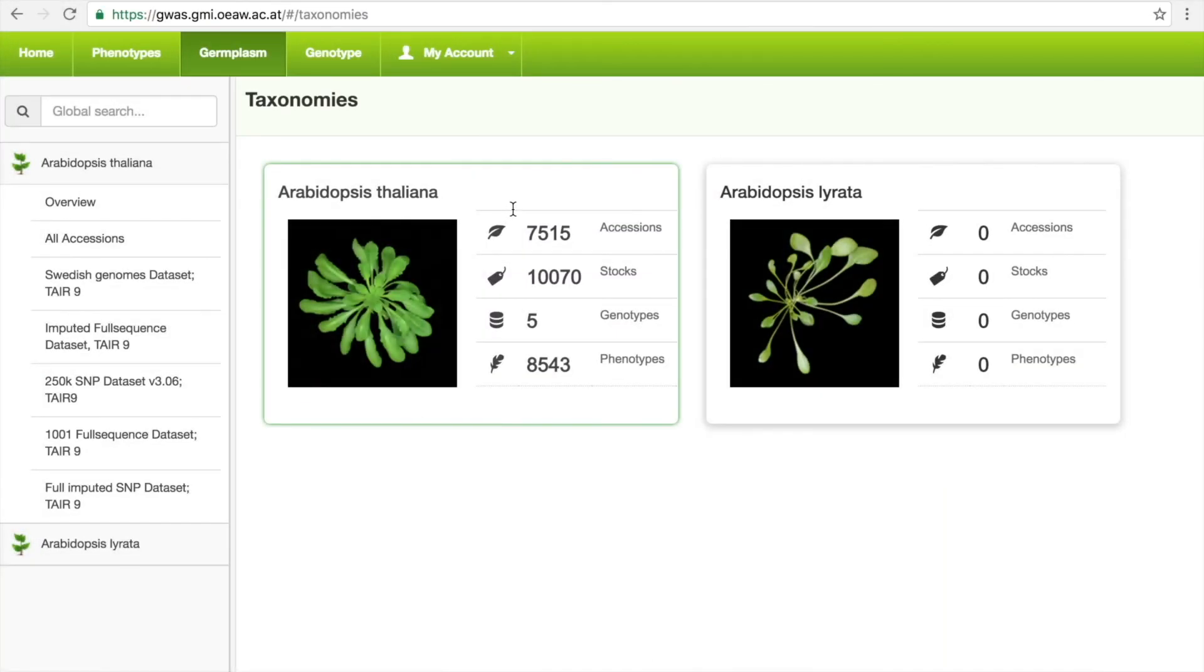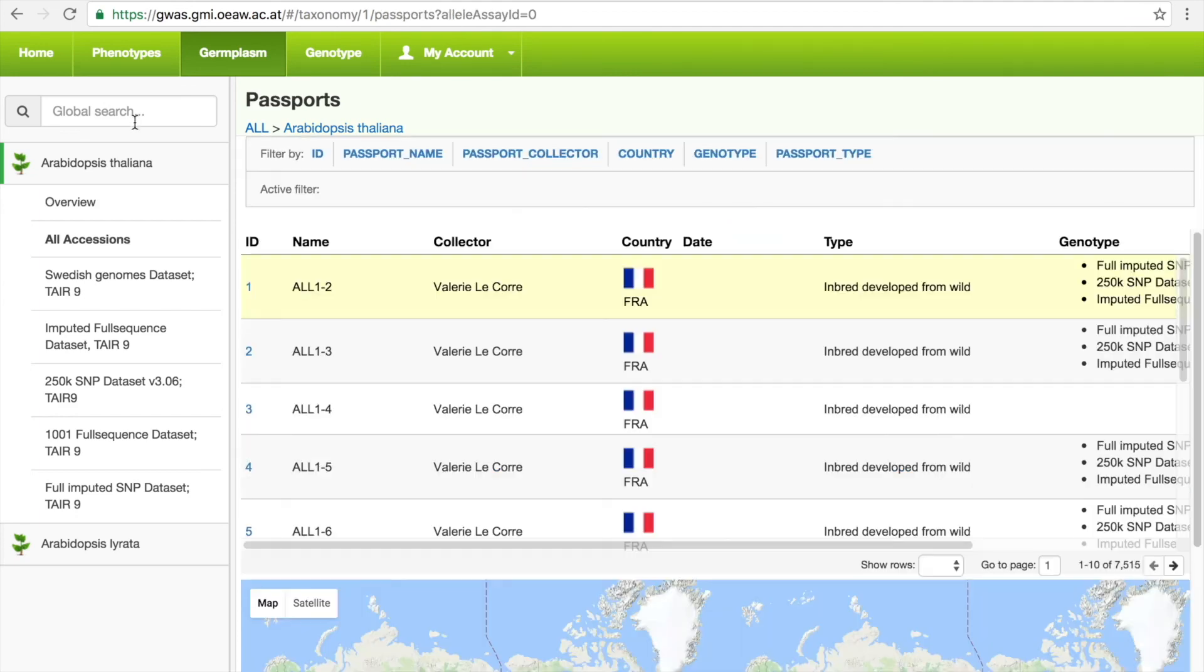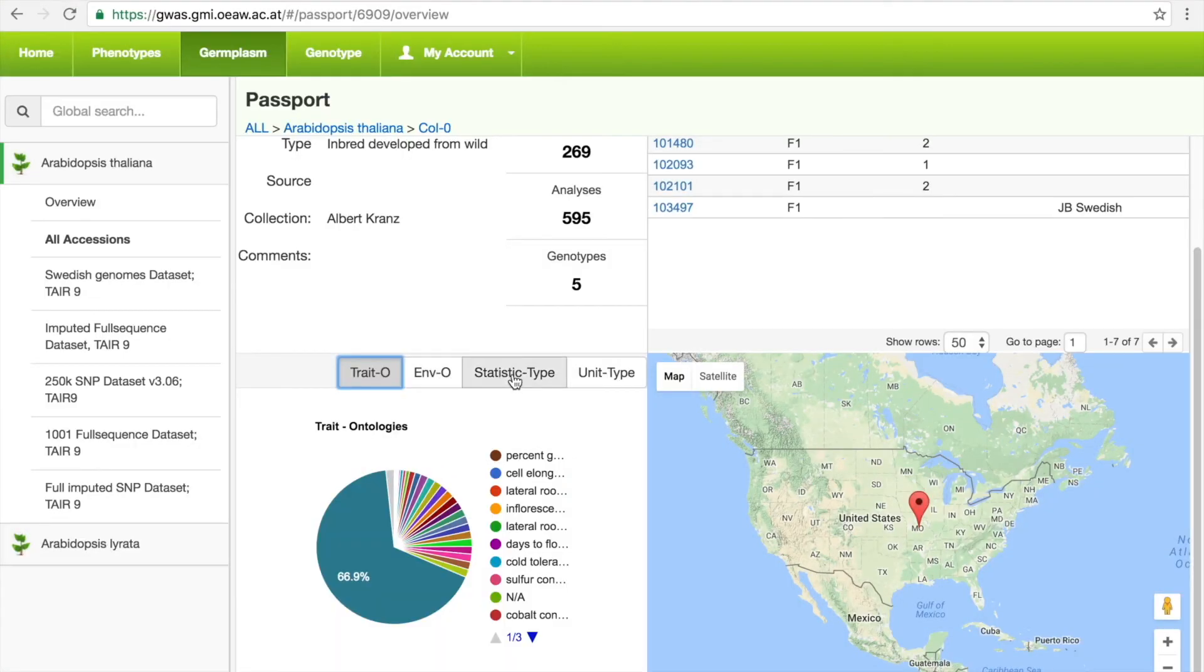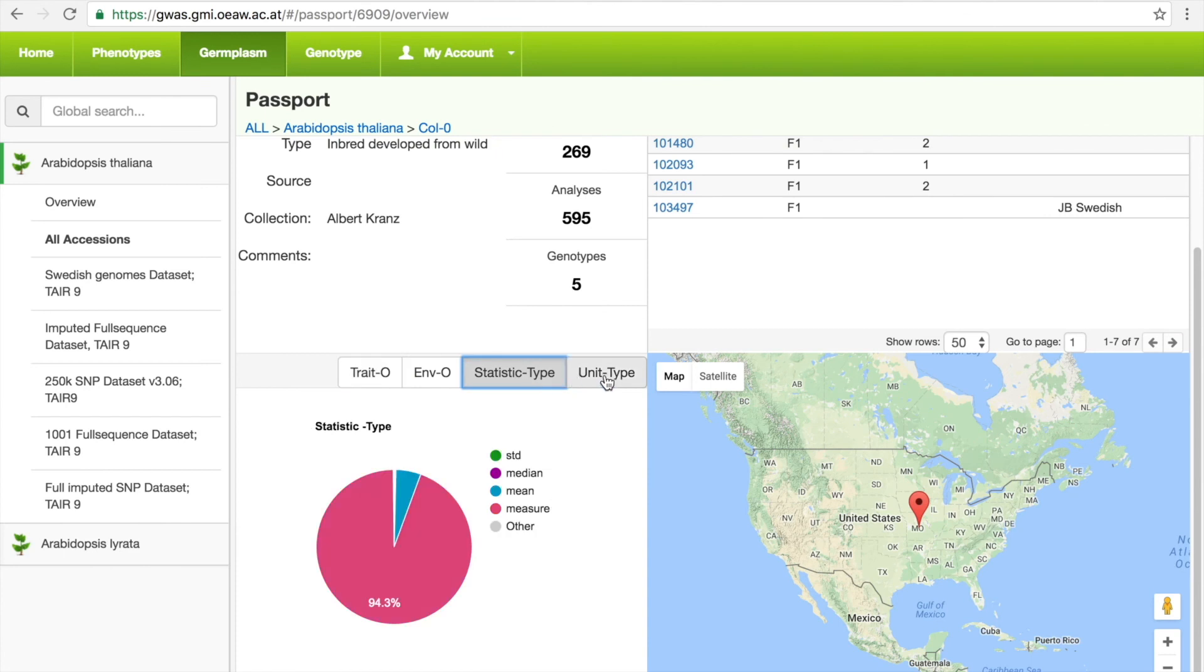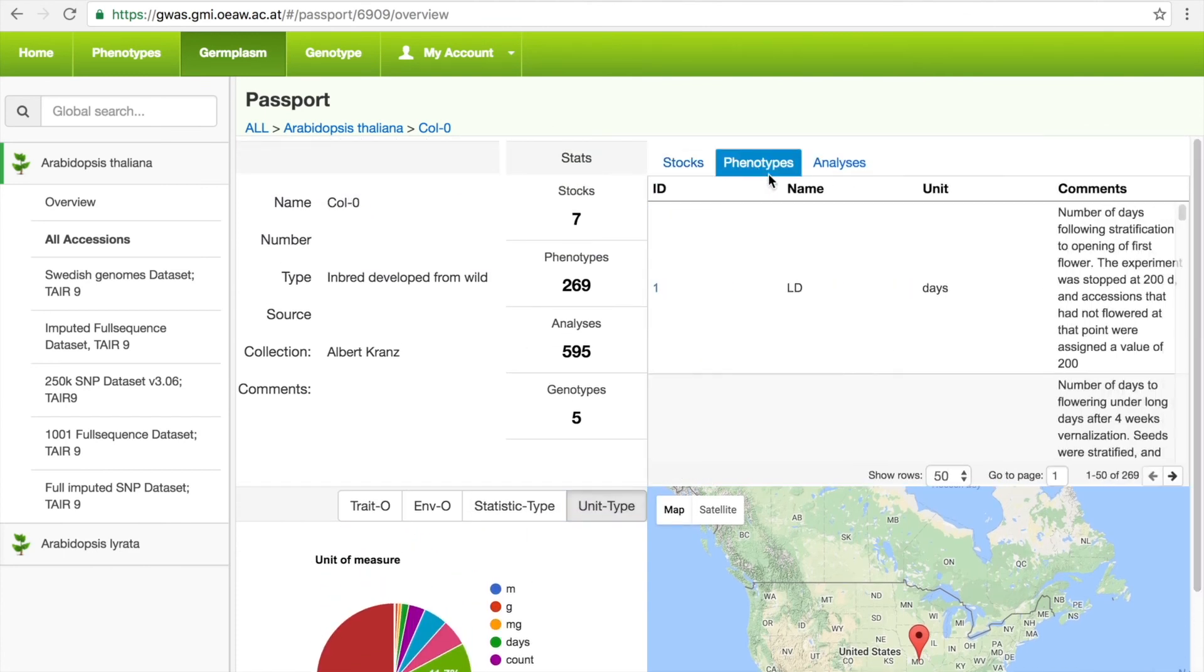As we store all of the studies in a single database, we can also search for individual accessions. One can search for Col-0, for example, to see statistics regarding how many studies it has been involved in, the list of studies and phenotypes, and navigate to a specific one.